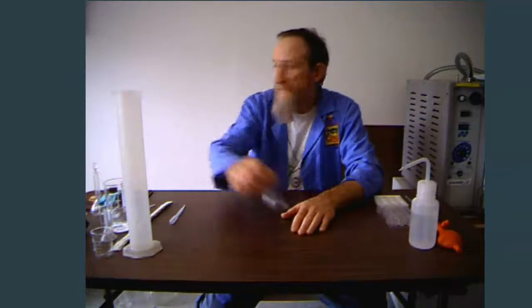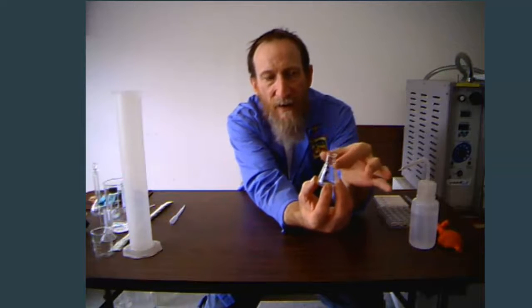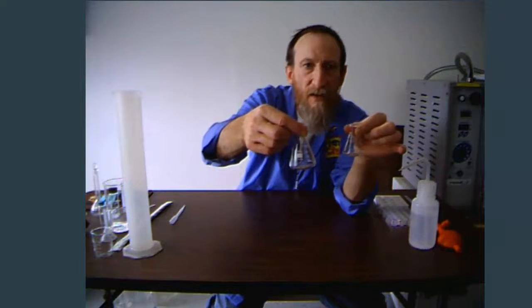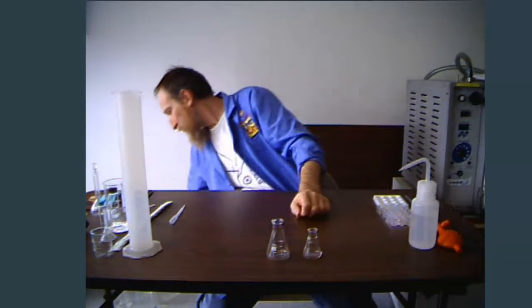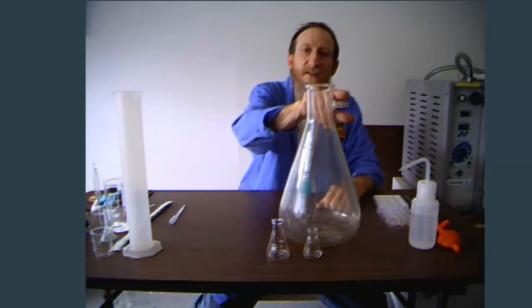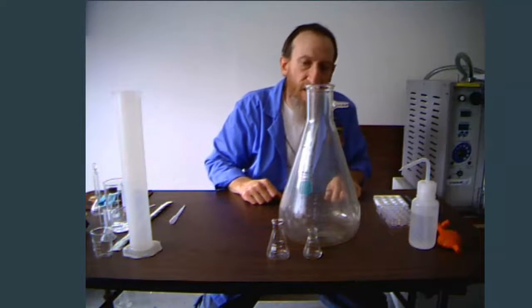Another really common piece of laboratory equipment is the Erlenmeyer flask. Here is the 25-milliliter Erlenmeyer flask — typically chemical reactions are going to be taking place in a flask like this. It's wider at the bottom and narrow at the top. Here's the 50-milliliter Erlenmeyer flask, and of course the kicked-up 4-liter Erlenmeyer flask. You might notice this one also has a little sidearm coming off the side; we can use this as a vacuum flask for vacuum filtering different substances.